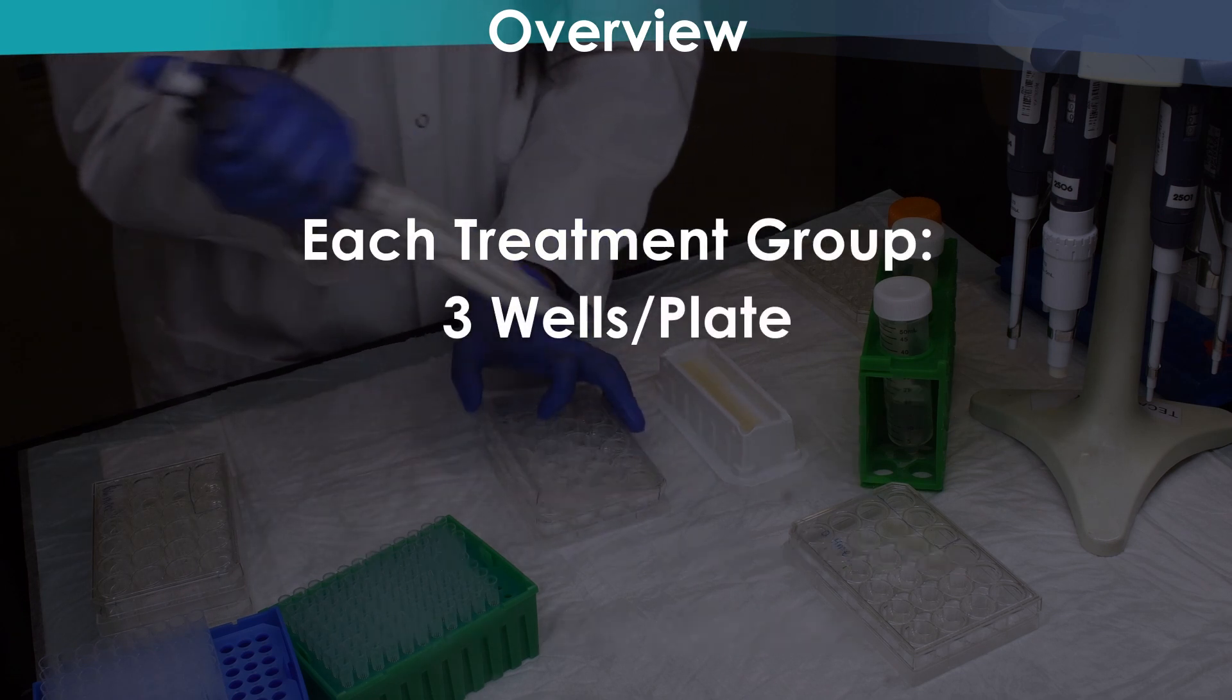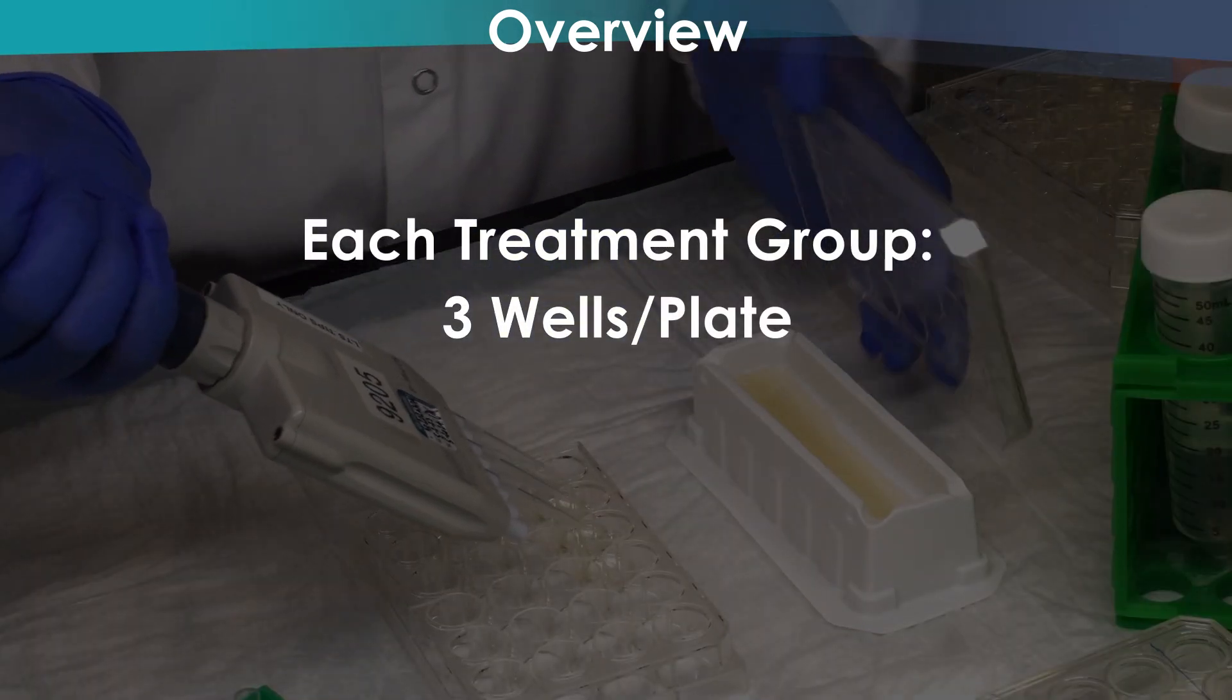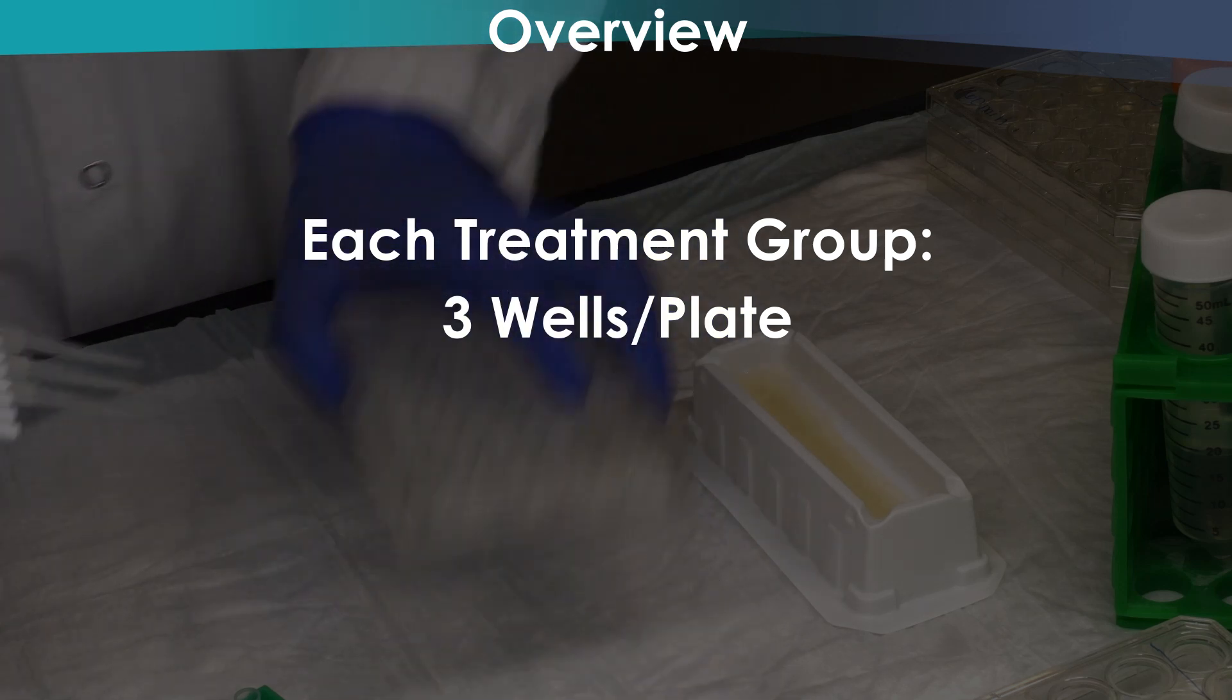Each treatment group should be run in triplicate, meaning each treatment group will use three wells in each plate per time point.